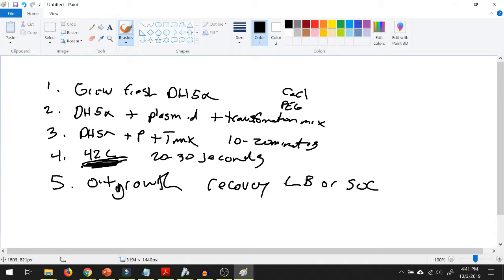In the kits we include LB, and you let the bacteria grow. So you want to put them at 37 C if possible, a comfortable temperature for bacteria where they like to replicate fast. Or if you want to leave them at room temperature, you just got to let them grow longer, right? It takes longer for bacteria to grow at room temperature, so let it grow longer.